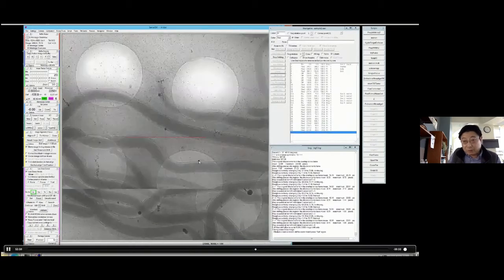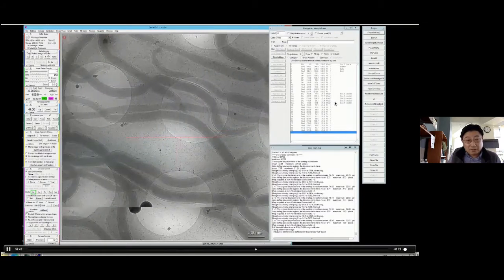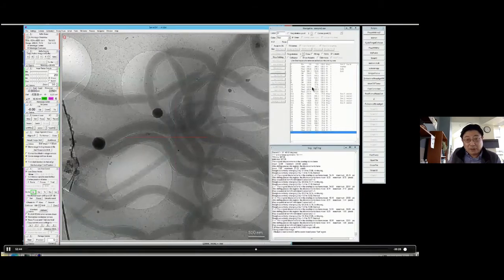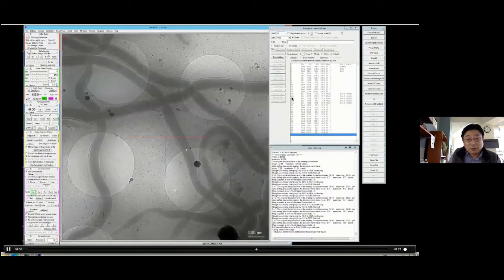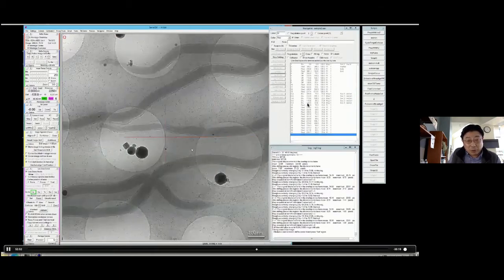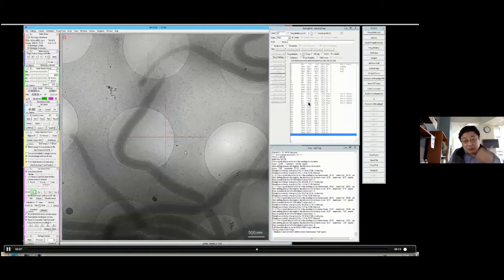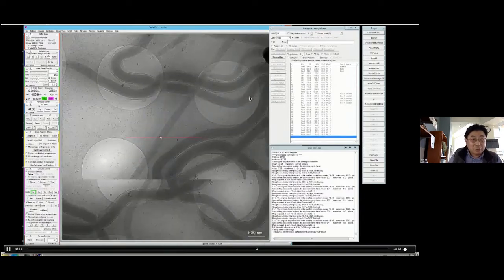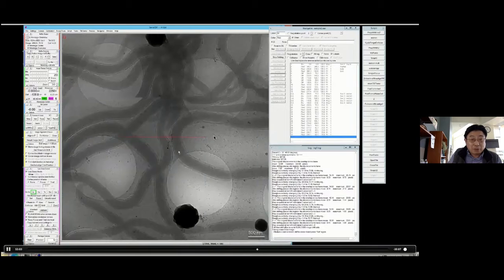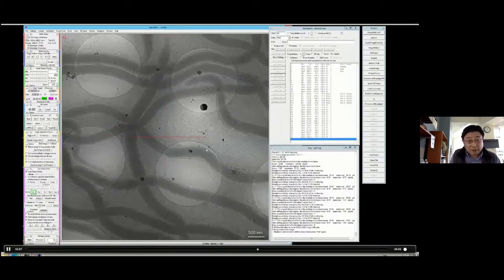You can add, right now I think we added about 15 targets. Obviously, if you want to collect 120 targets, you can easily spend a lot of precious microscope time. So we typically keep the microscope running, then use another dummy version of the Cryo-EM to do what we are doing now, because you don't want to waste the microscope time.